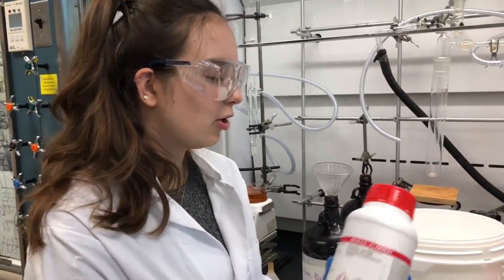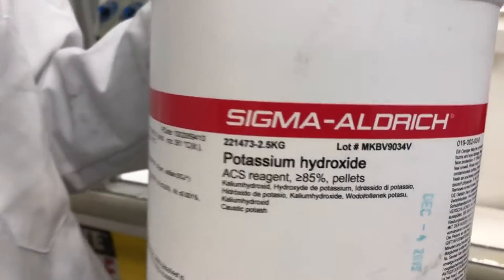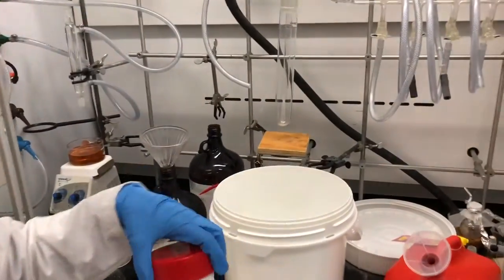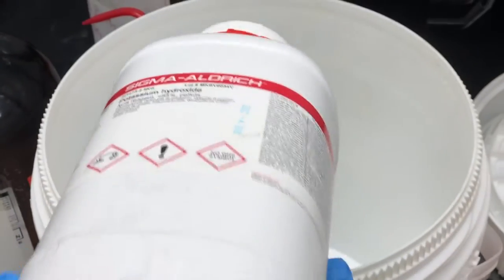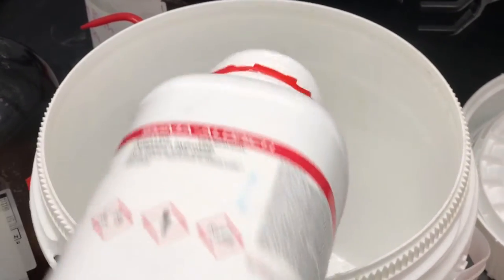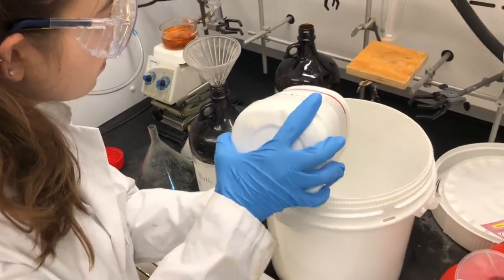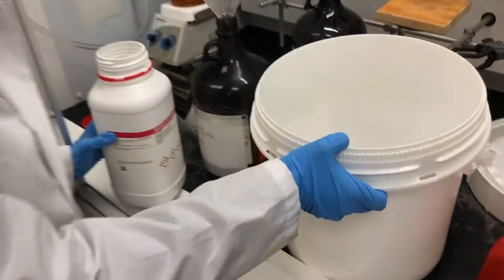So now that our container is all clean, we're going to sprinkle in about two to three inches of the potassium hydroxide. Our goal is to cover the entire bottom with potassium hydroxide.